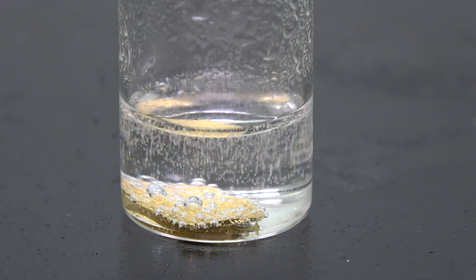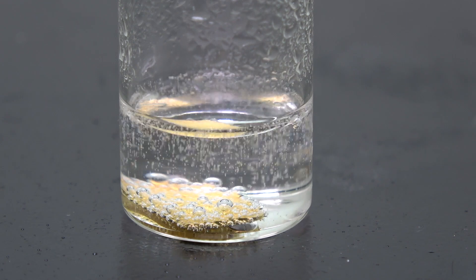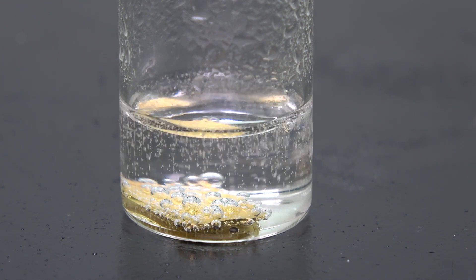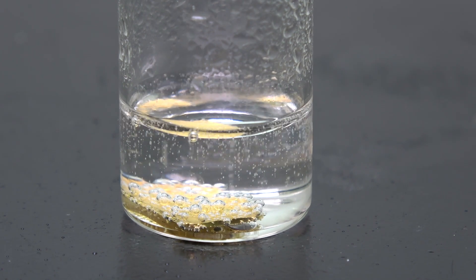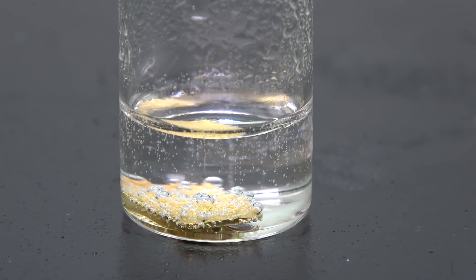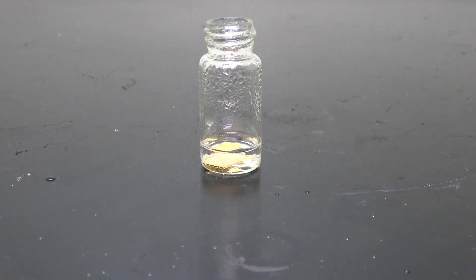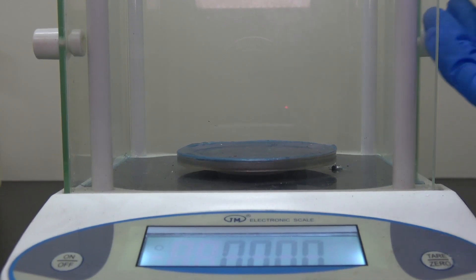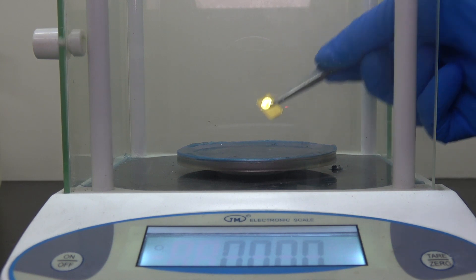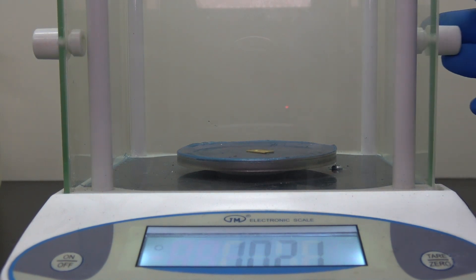This can be an indication of a reaction taking place between the gold and the acid. But again, this can just be oxygen from the decomposition of hydrogen peroxide, and the gold simply acts as a nucleation site. Well, the only way to know for sure is to take it out and put it on the scale. And it appears no mass is lost.